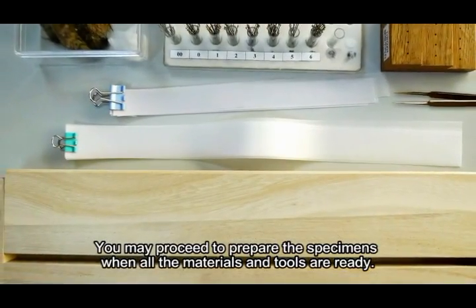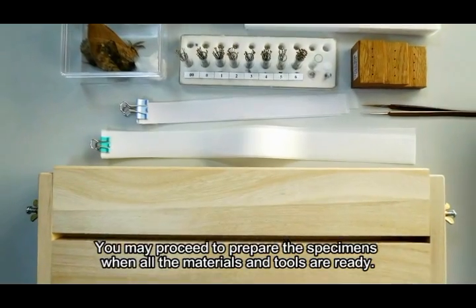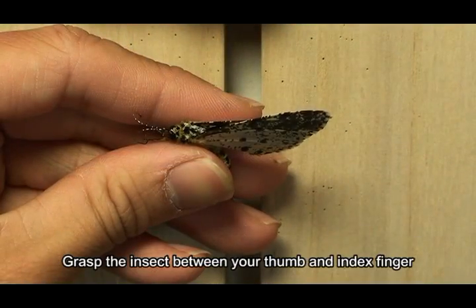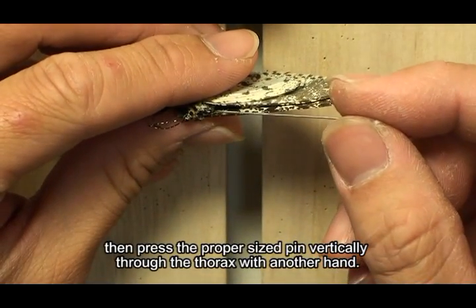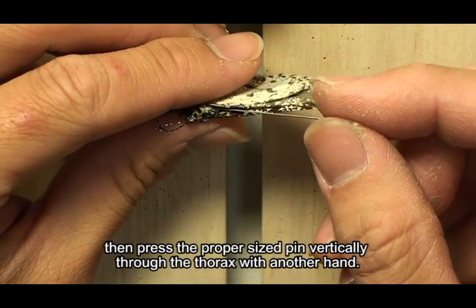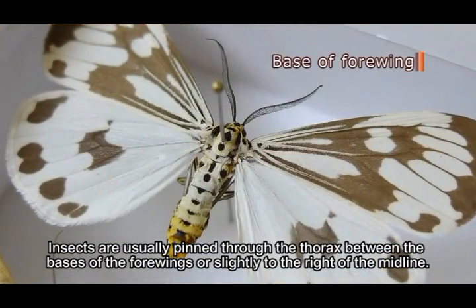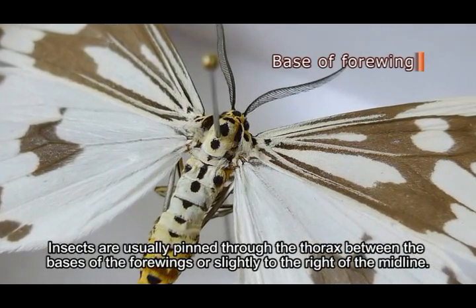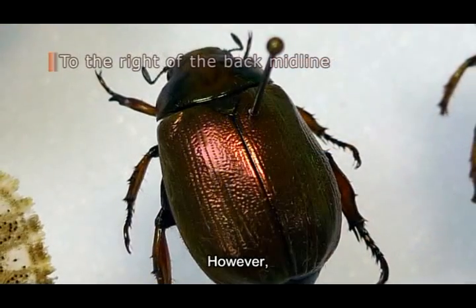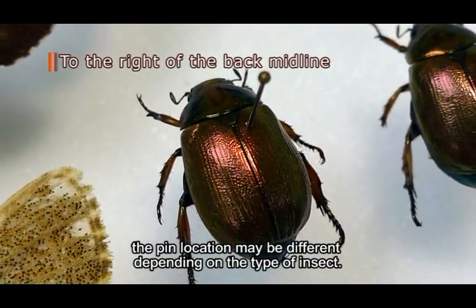You may proceed to prepare the specimens when all the materials and tools are ready. Grasp the insect between your thumb and index finger, then press the proper sized pin vertically through the thorax with the other hand. Insects are usually pinned through the thorax between the bases of the forewings or slightly to the right of the midline. However, the pin location may be different depending on the type of insect.